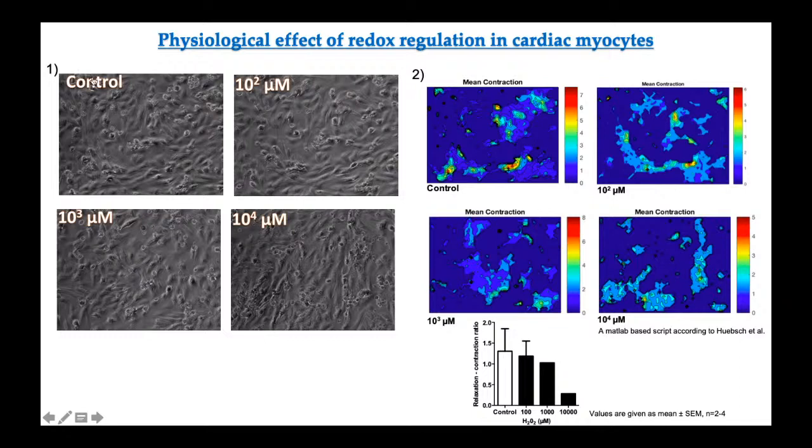So I did the experiment in 4 different wells of a 6 well plate. I got my neonatal rat cardiomyocytes and put them and grew them over the cell culture plates. And then there are the conditions that I gave them.